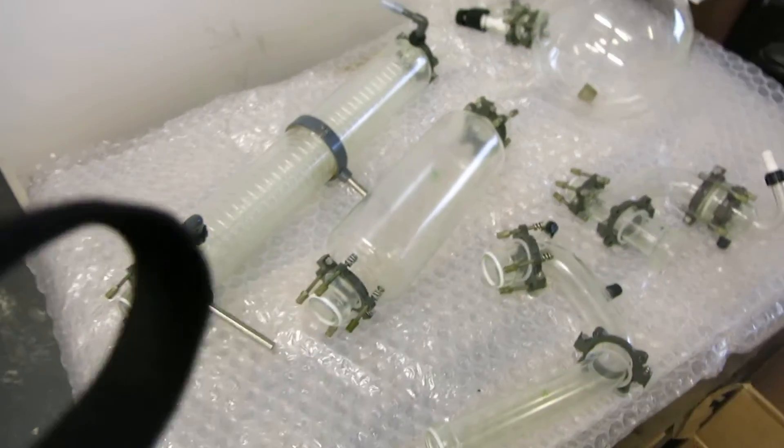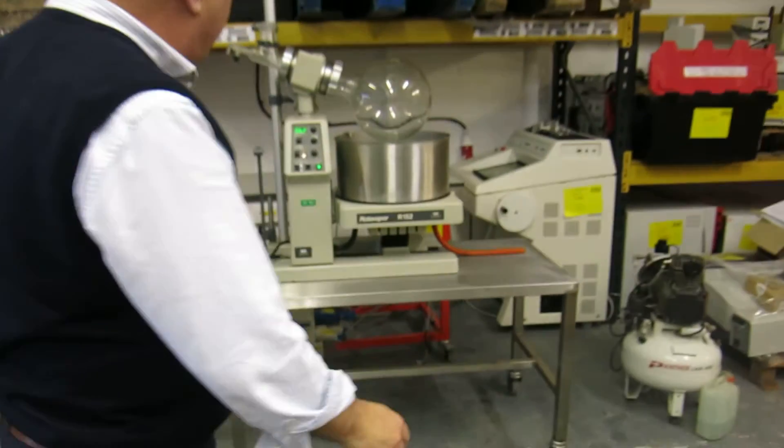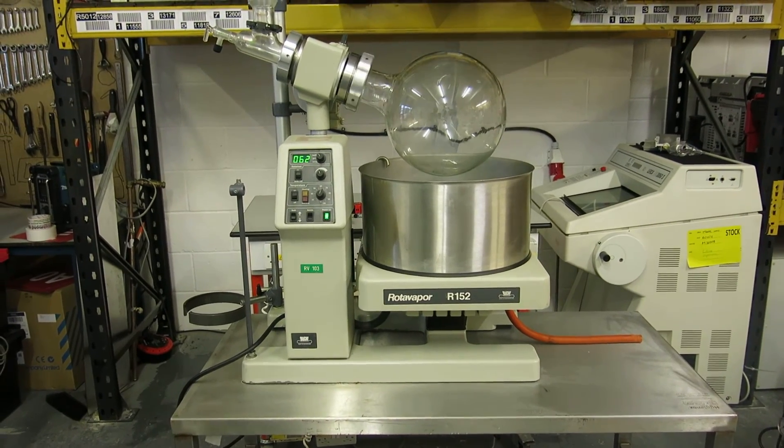So that's everything for the Buki R152 pilot-size rotary evaporator from Richmond Scientific. I hope this has been a useful video — thank you.